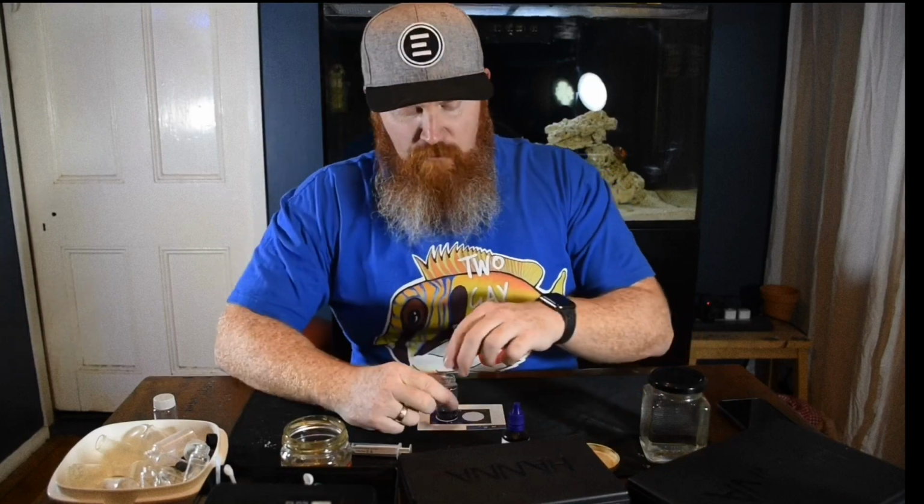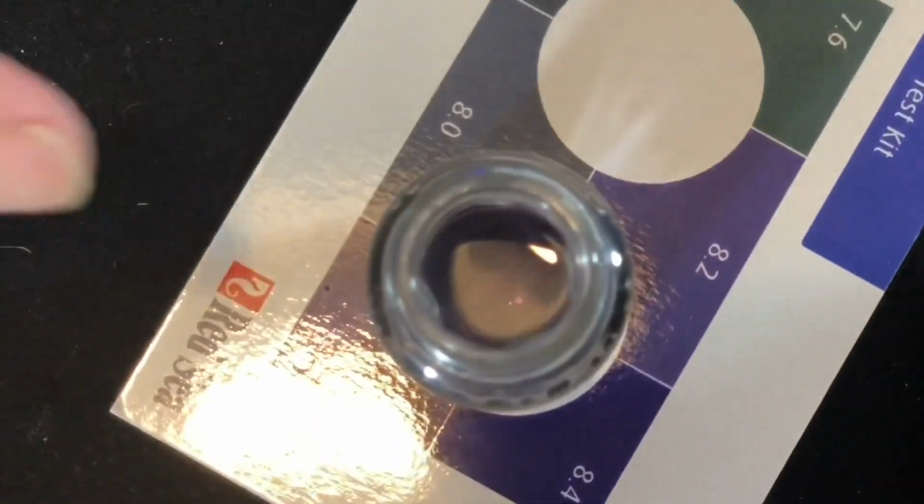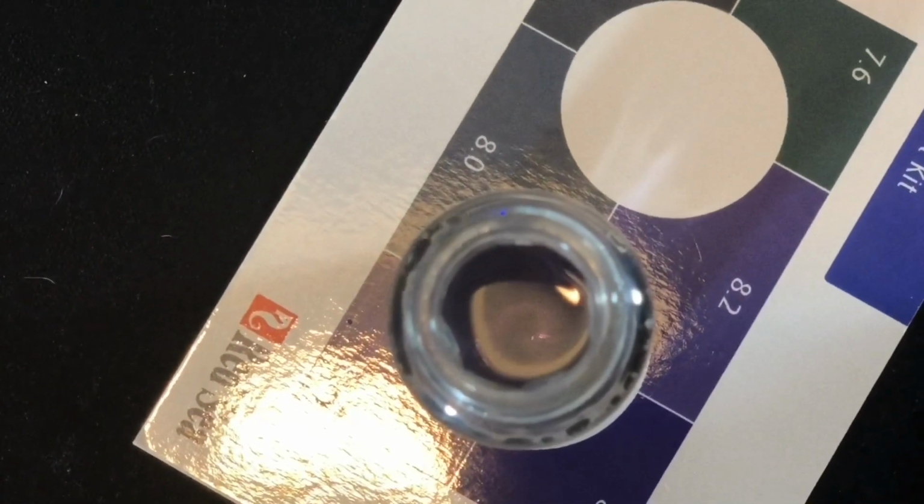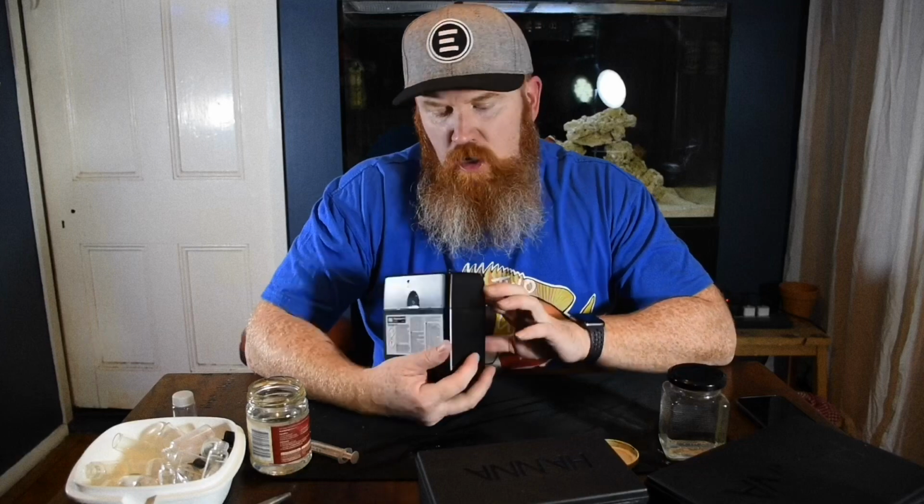So Darren, keep a record of that. So matching the colour of the liquid with the colour on the card. So 8.0. All right, next test we're gonna do is the magnesium. So we use the Red Sea Magnesium Pro test kit.